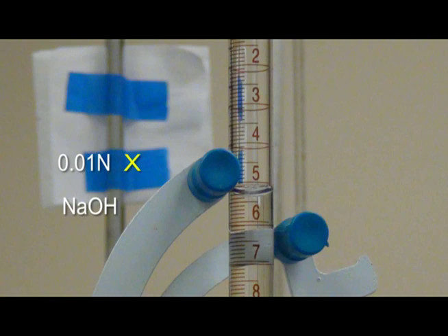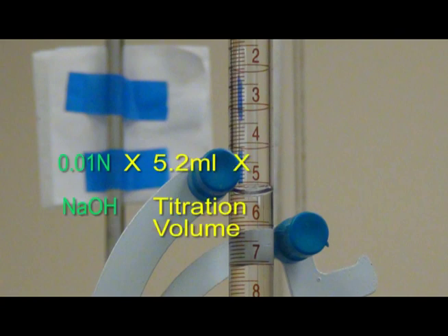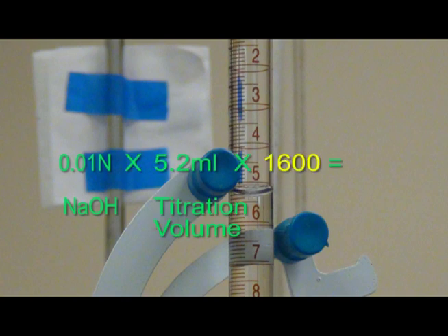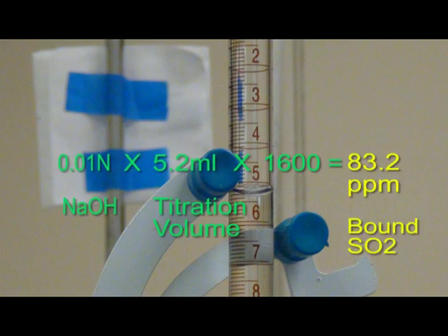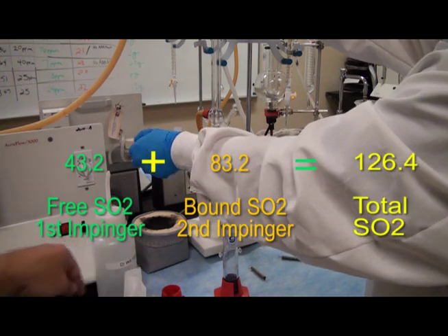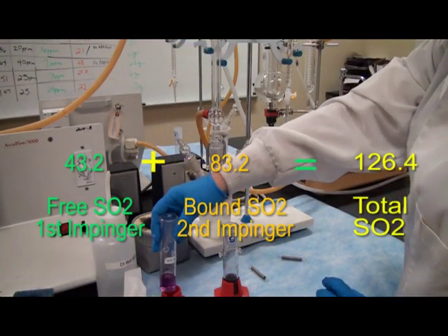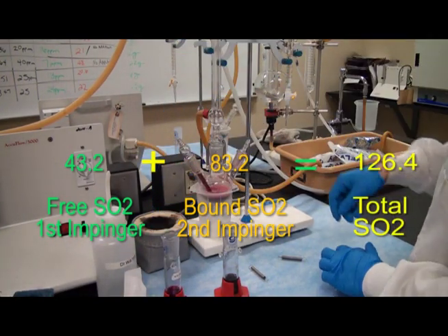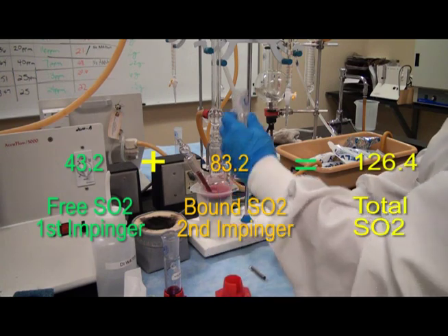To calculate the bound SO2 in the sample, multiply the concentration of sodium hydroxide, in this case 0.01, times the mls dispensed from the burette and multiply the result by 1600. Add the free SO2 value from the first impinger to the bound SO2 value from the second impinger to obtain the total SO2 level. The result will be total SO2 in parts per million.